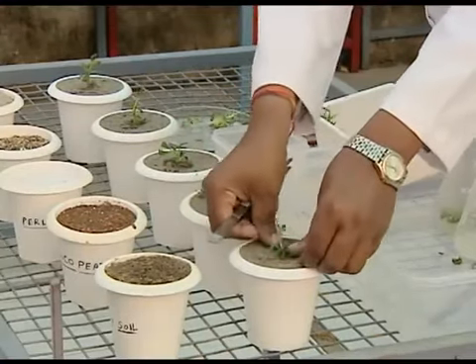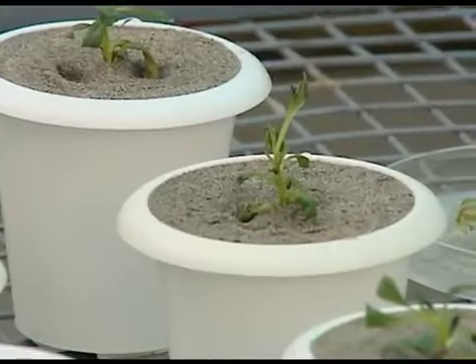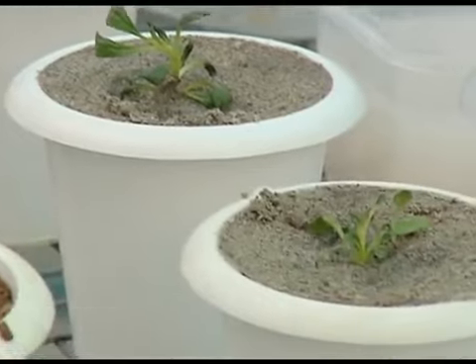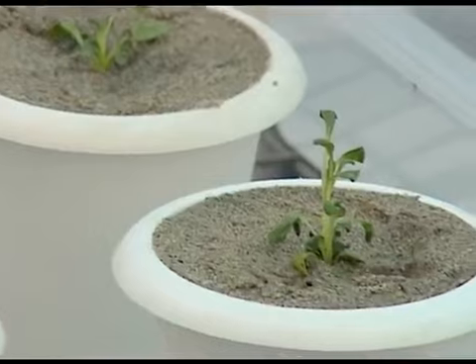After rooting and growth of plantlets up to 3 to 4 inches, shift these to another potting mixture containing garden soil, sand, and well decomposed farmyard manure in the ratio of 1:1:1.